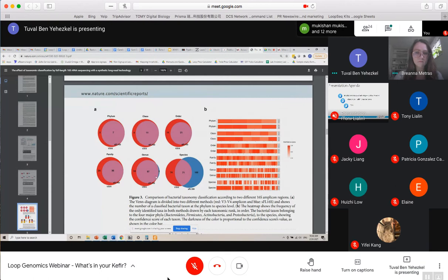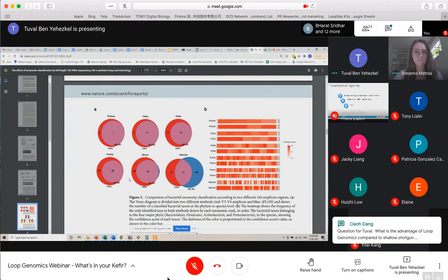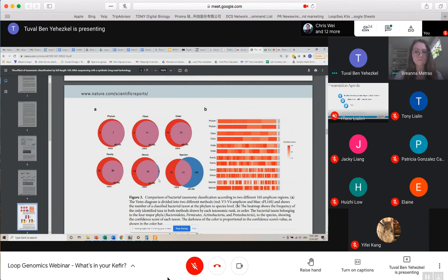Basically you can see that the effect on less resolved classification calls is not significant. Where you start seeing things decouple is at the genus level, but really the most important effect is at the species level. At the species level, you can see with this Venn diagram that they basically completely decouple, and with loop they were able to identify roughly 100 different species, while with V3, V4, roughly 74. So there was an increase of roughly 50% in the number of species that they could identify.